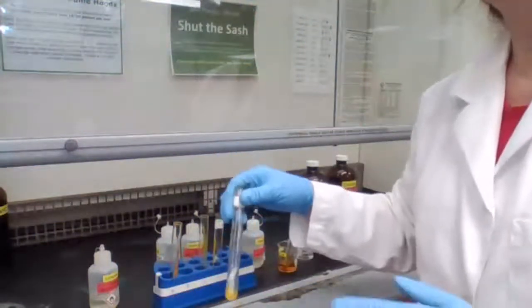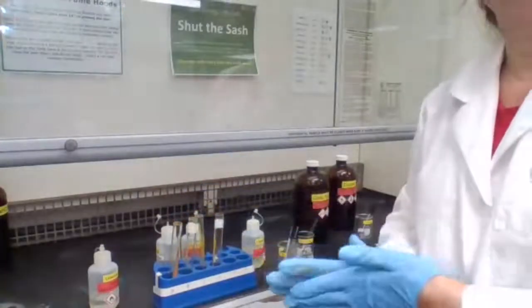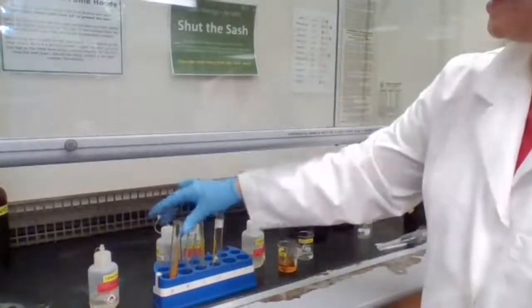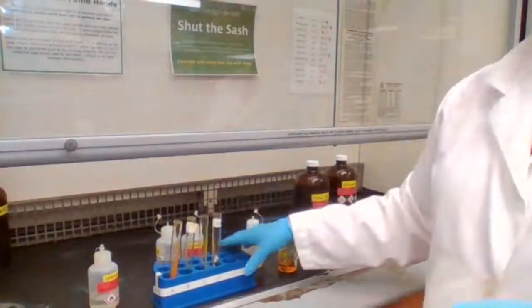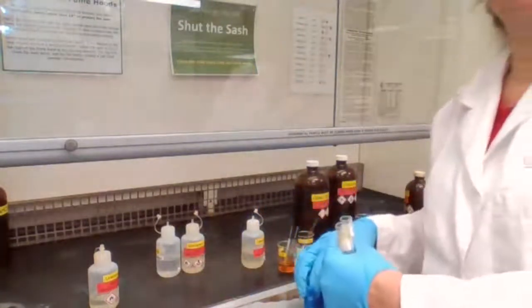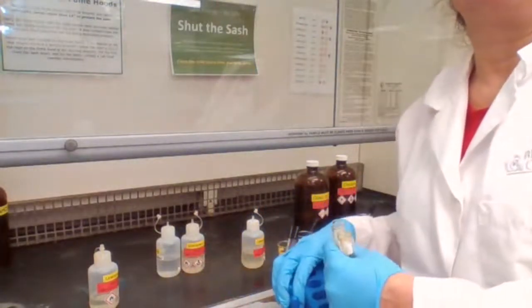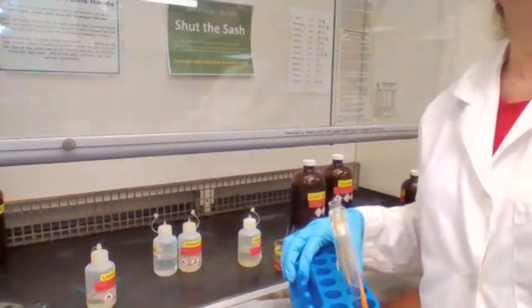So B is negative. Okay? B is negative. A, C, and D are positive. Okay. We are going to move to the next step. Yes, all of them go with the 2,4-dinitro. Yes.